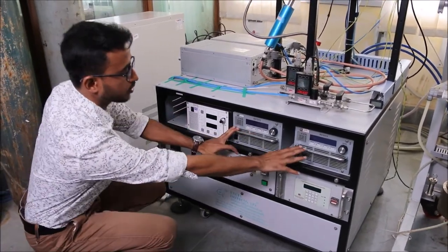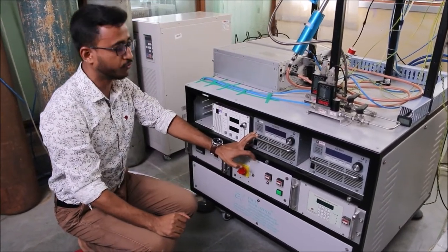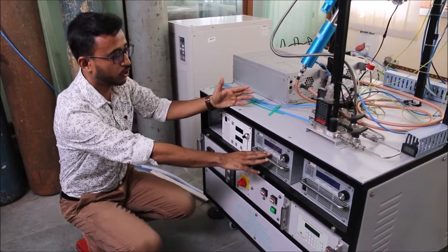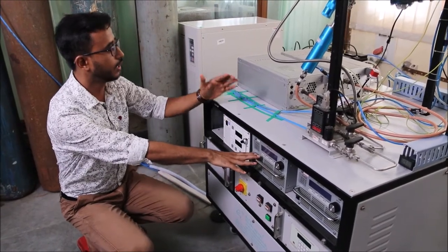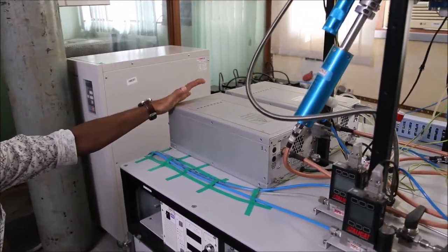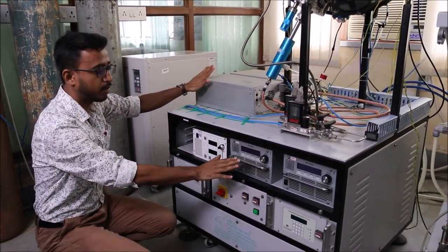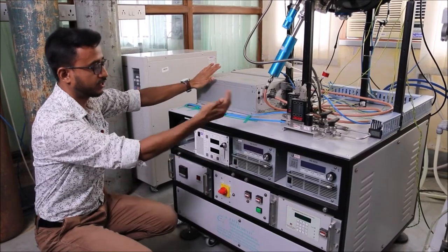We have two power sources for RF. We use 13.56 MHz of frequency, and because at that frequency the power cannot be directly transferred to the load due to impedance mismatch, we need to connect a matching network. We have two matching networks for these two RF sources. It matches the impedance of the target with the power source so that maximum power can be transferred from the source to our target, and we won't get any reflected back power.